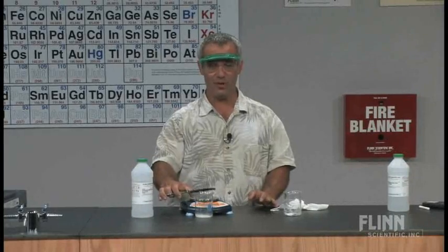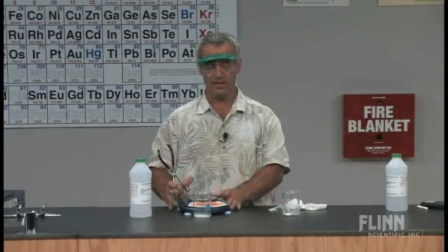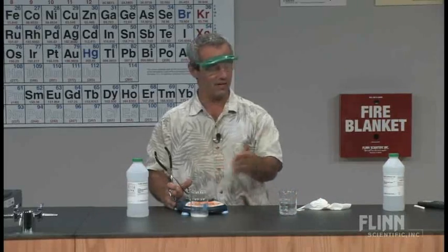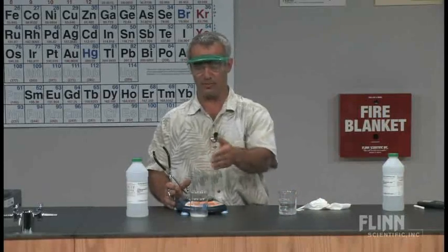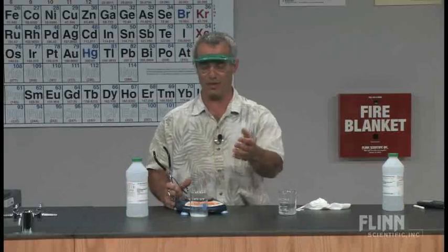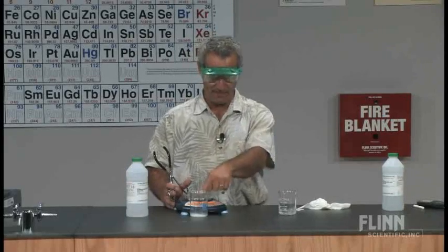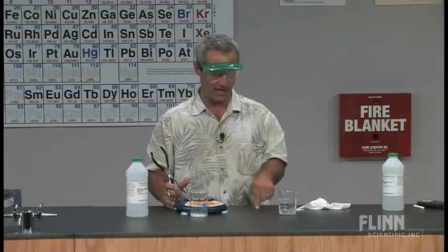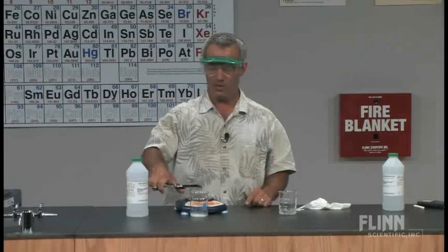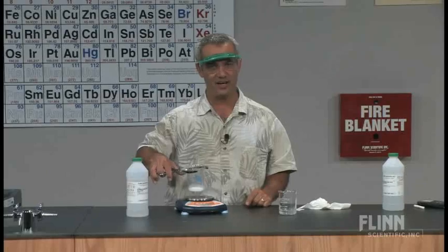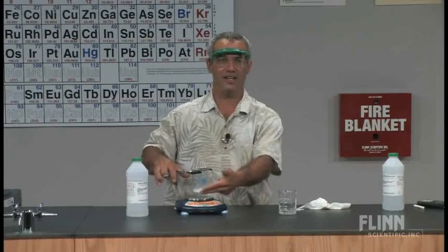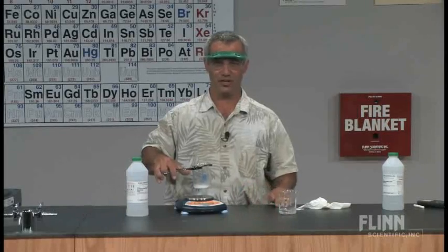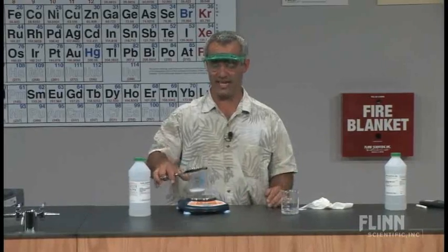And then they weigh it. Literally, when they come to weigh it, they have to weigh it in front of me on a scale at the front of the room. They have their paper there and they're saying from the calculations, the beaker, the zinc atoms, and the chlorine atoms all combined will weigh 111.24 grams. We set it on the scale like that. Their grade is based on how close that mass is to the target they established. So I call it a target lab.